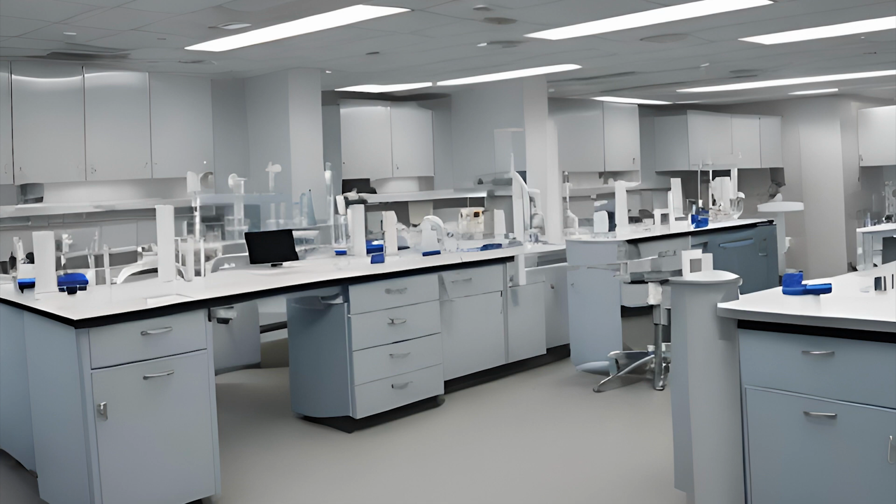The aliquot will still need to be labeled with the same patient ID. Aliquots of specimens are commonly created when multiple tests are ordered on a single specimen, or when tests are going to be performed on different instruments at the same time, or if different areas of the laboratory department all need to receive part of that sample for simultaneous testing.